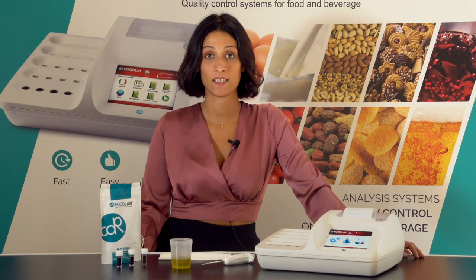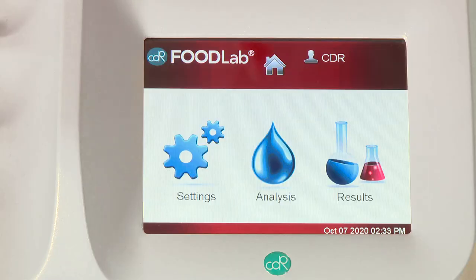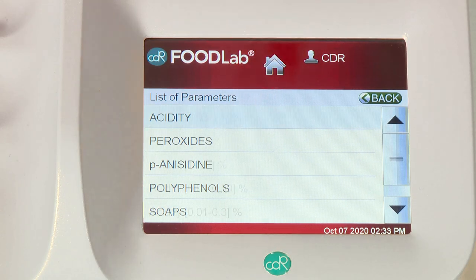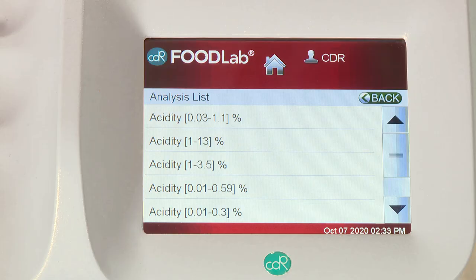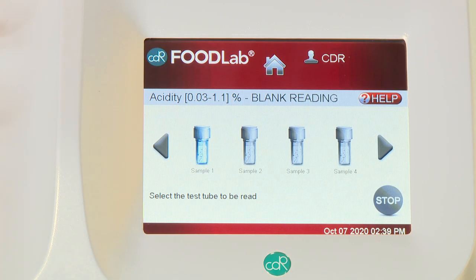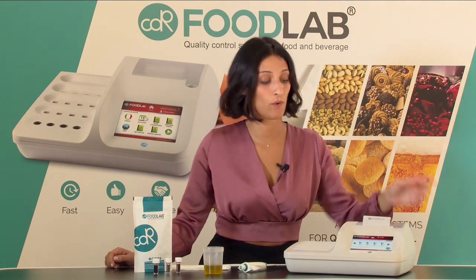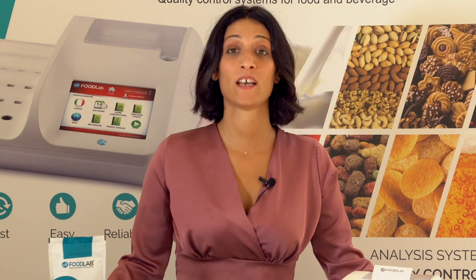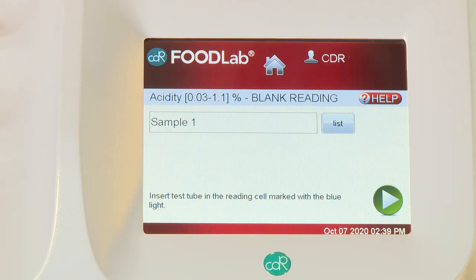You have only to select the desired metrics on the display, the analysis and the measuring range. Then select sample one. It's simple — you just have to follow the instructions on the display.